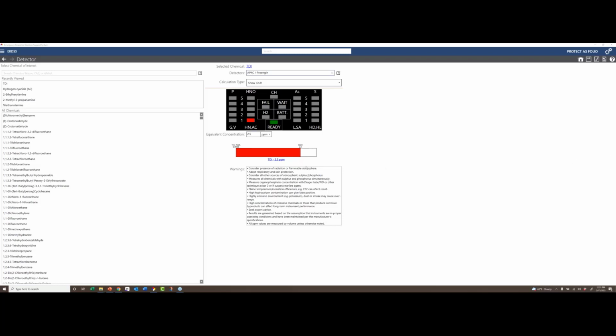And we can actually do more than just the elements that we're seeing, which we do for biological detections, where we add in sodium, potassium, and calcium as additional elements. So we can handle multiple elements simultaneously as well. Those are just the ones we have chosen because that's what's needed for this type of application.